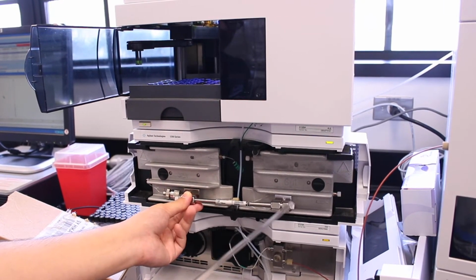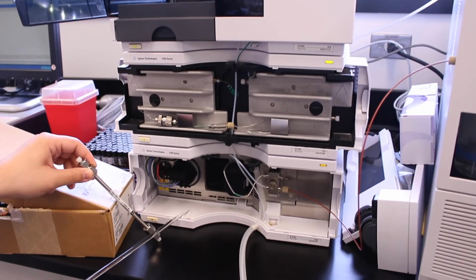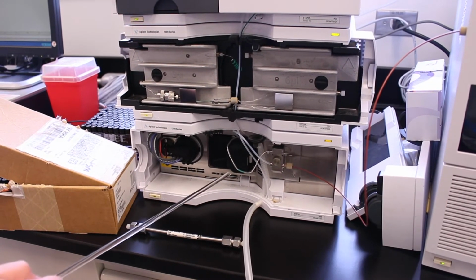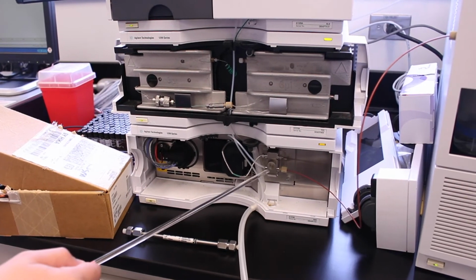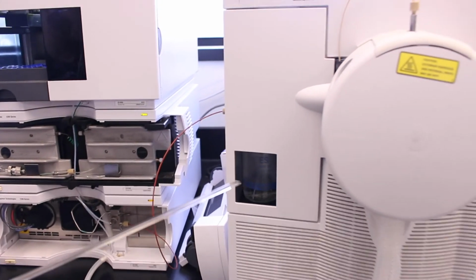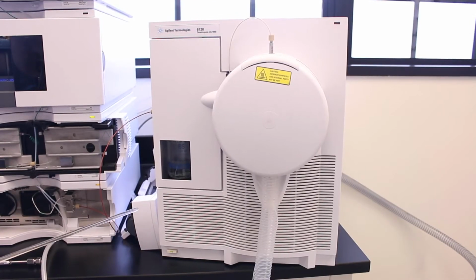And then after that, it goes back into the system, and then it actually measures the UV of it. So that's another advantage of LC, that it measures UV absorption, kind of like in TLC. Not super important for our purposes, but after it enters the UV detector, it exits and then enters this transfer line, this red piece of tubing, and then it enters the mass spectrometer. And this is where it's going to be ionized and then measured.